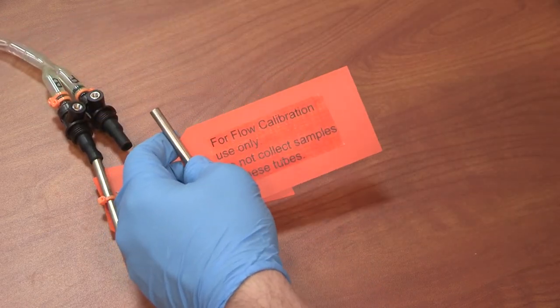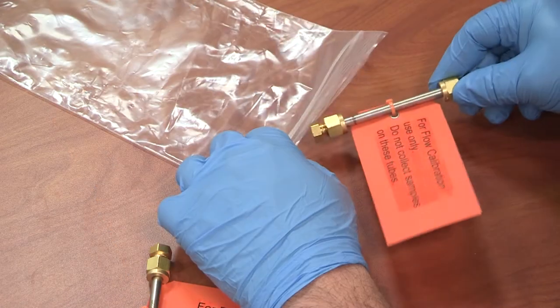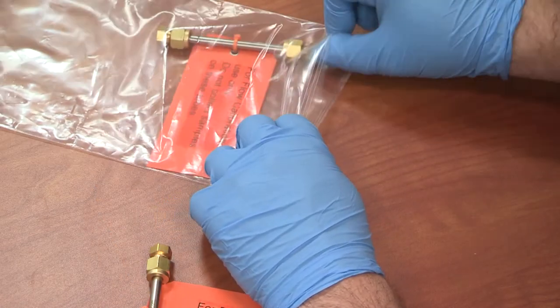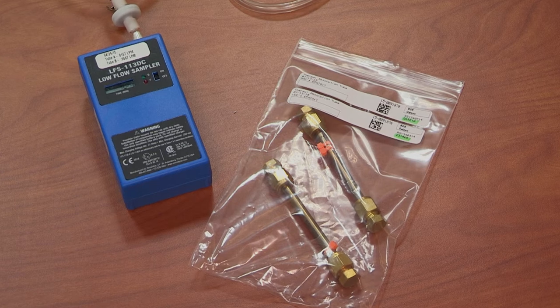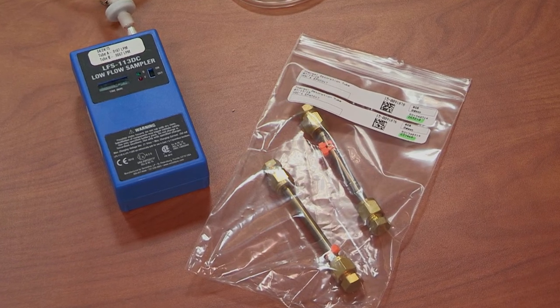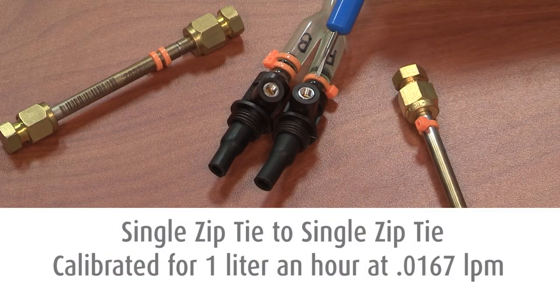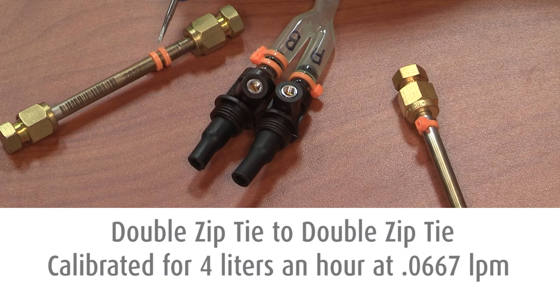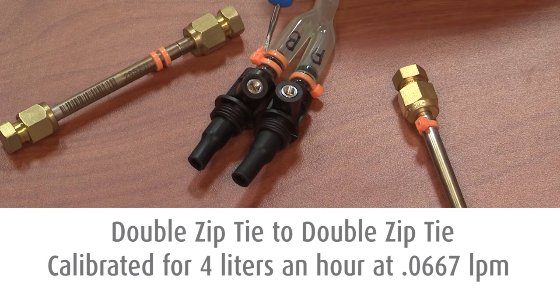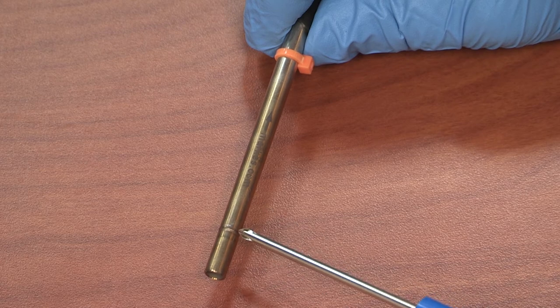Once your calibration is confirmed and you are ready to sample, remove the calibration tubes and reattach their Swagelok caps with the provided wrenches. Place them back in the original packaging. For your convenience, the tubes have been pre-separated for each individual sampling pump and pre-assigned to a designated flow rate. The tube with a single zip tie connects to the tubing with a single zip tie and is calibrated for one liter per hour at 0.0167 liters per minute. The tubing with double zip ties connects to the tubing with double zip ties and is calibrated for four liters per hour at 0.0667 liters per minute.